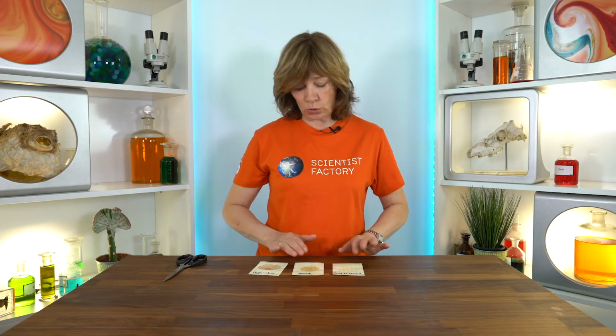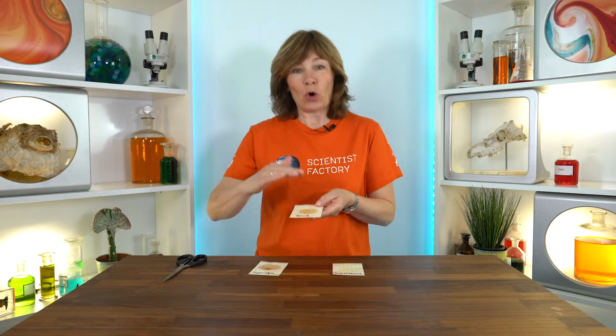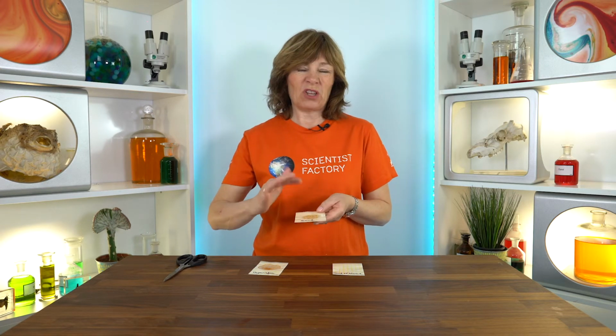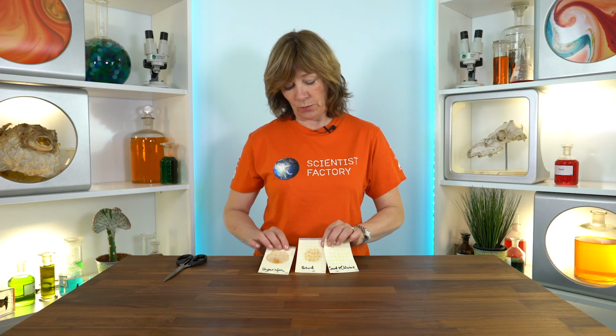One thing that's important when you have grown-up bacteria like this, you no longer open the film, because then you can get in contact with bacteria that you really don't want to get in contact with. When you put these in the trash, you put it where things are to be burned. So that's the best way to get rid of these.